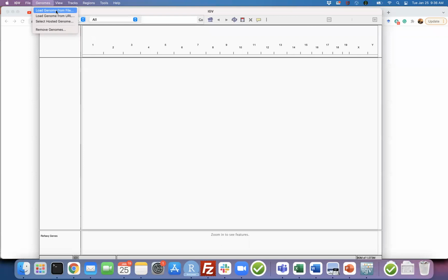If you have your own genome, for example, if you use the flu genome or the COVID-19 genome, and you just want to visualize your reads on that, you can download the file using FTP or put it in a web accessible area somewhere and then use the URL while loading the file. Okay, when you load, it's going to come. See, I did, for example, the EGFP gene.